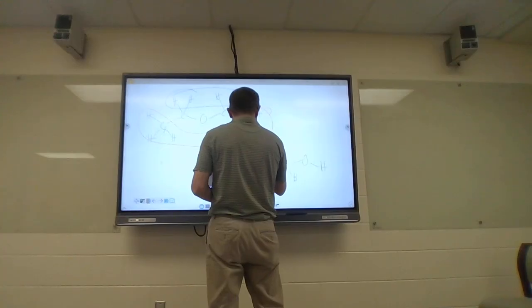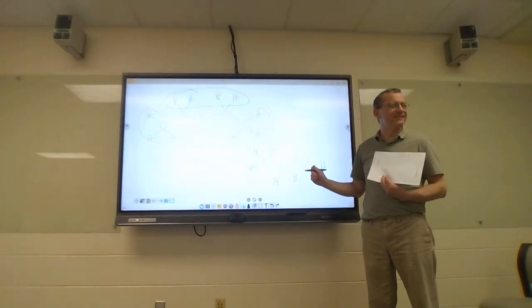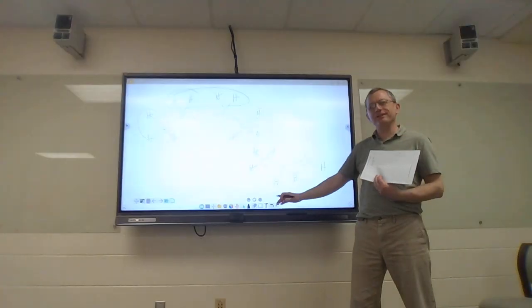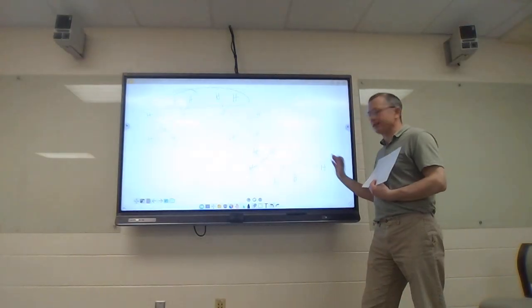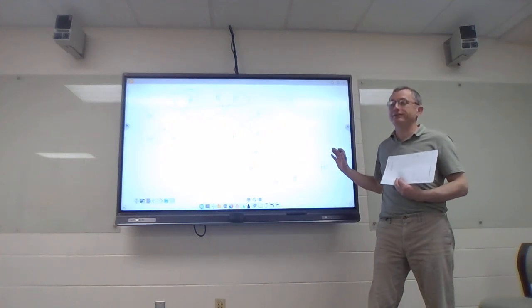So yes, I am trying to show you a pattern where you see that ethyl group when it's next to a bromine, when it's next to an oxygen in ether, when it's next to an oxygen in ethanol, alcohol, right?